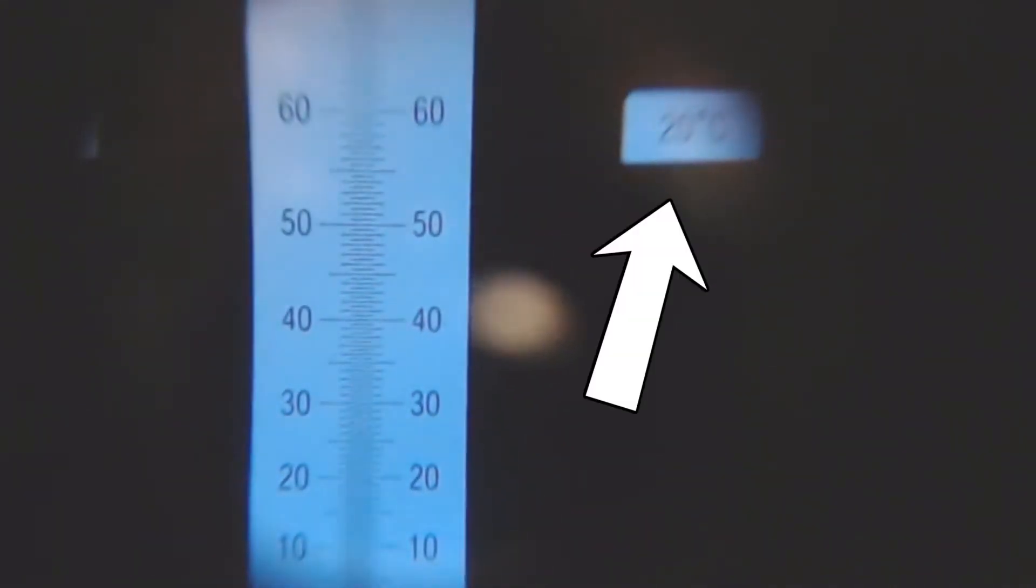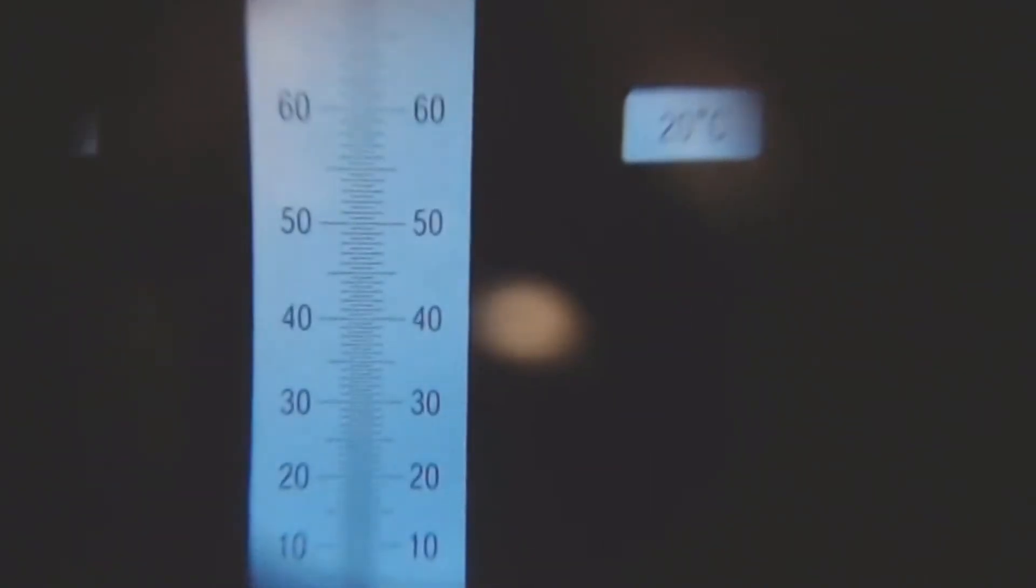Ordinarily, tools like this require your sample to be at a specific temperature like 20 degrees Celsius, but this tool automatically calibrates for temperature as long as your sample is between 10 and 30 degrees Celsius, so no additional calculation is needed.